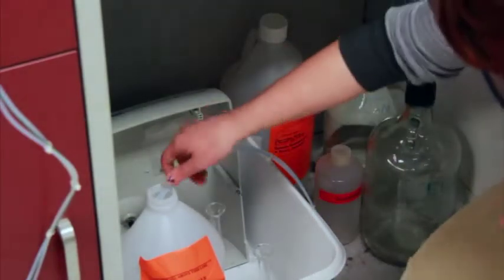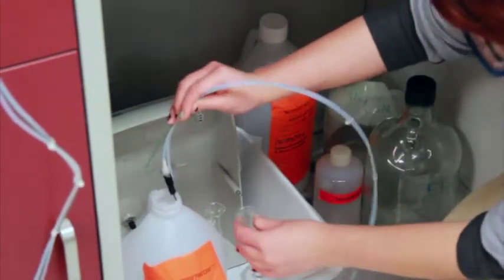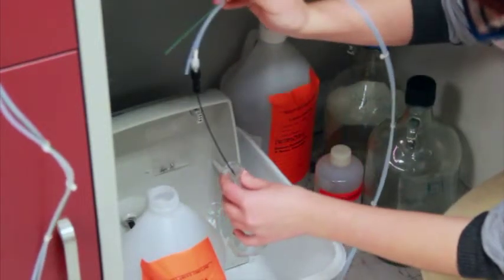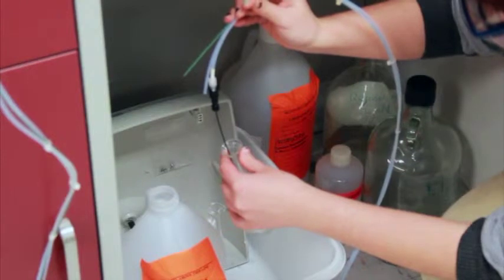In order to check the flow rate, you need to remove the tube from the waste jug underneath the IC, and then you place the long black tube into the graduated cylinder, and you let it run for about 1 minute. At the end of 1 minute, you need to check the level in the graduated cylinder. It should be about 1 milliliter.